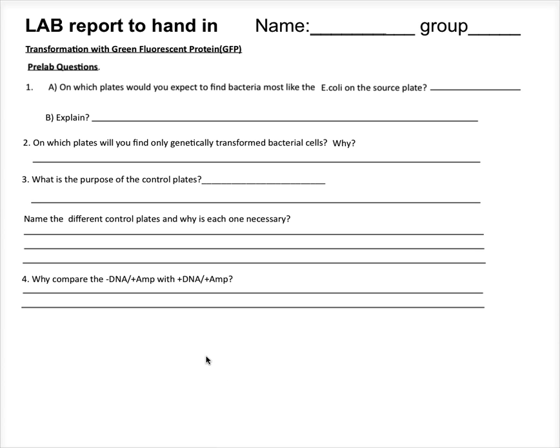And let's make our bacteria glow green. Should be pretty cool if it works. And it should work. It does work. It's worked in the past.